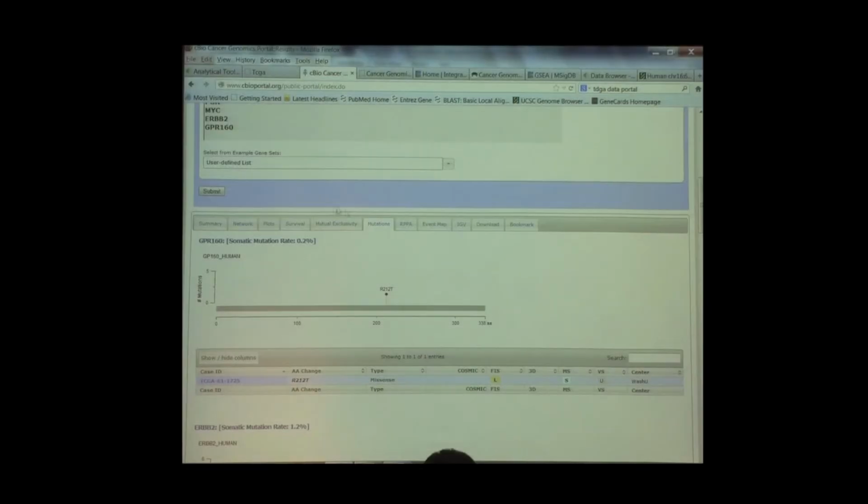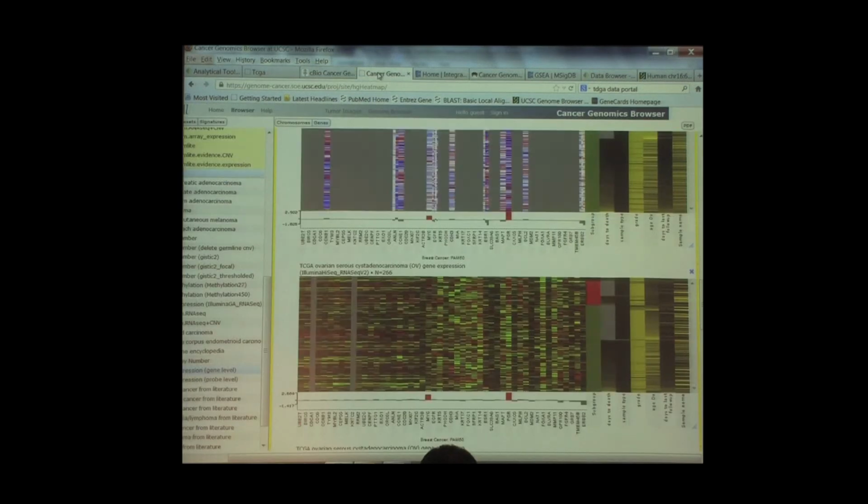Now I'm going to tell you, this is going to involve having to add a clinical annotation, subsetting on that annotation, and then asking the question of what are the statistics. So that's what we did for the age of diagnosis.